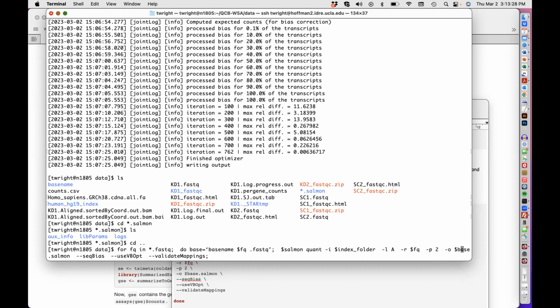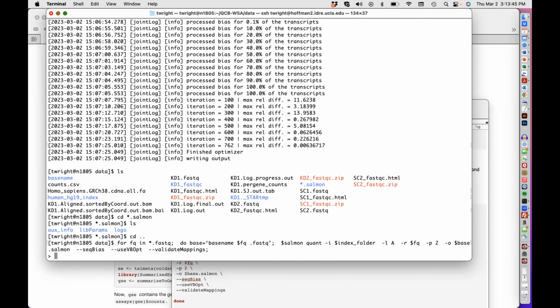Is there a smart asterisk that's getting screwed up? It could be that the RTF file you're using, that asterisk looks different and registers as different. And then, yeah, press enter again. And then done, yeah.